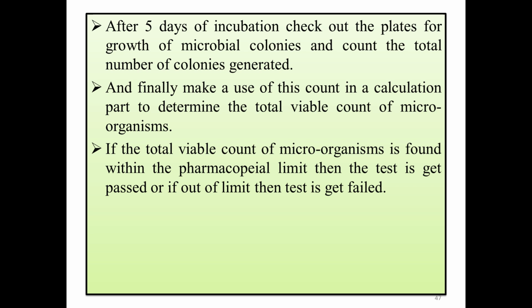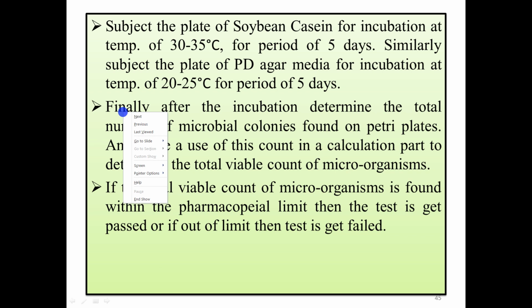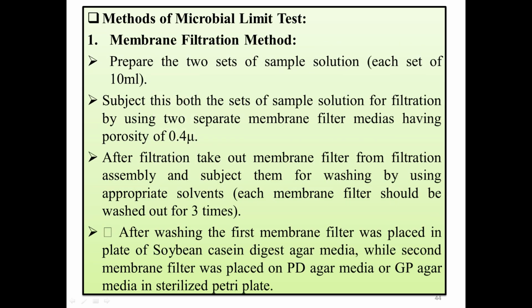Okay, the first one was the membrane filter method. In that method we have used the membrane filter for cultivation of the microorganisms.